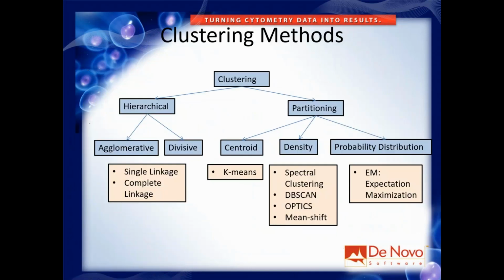So there's a lot of clustering methods. This is just a small subset of the common ones. And here I want to pause and talk about some terminology that is commonly thrown about and dispel some myths. When people come and talk about these, they're going to talk about unsupervised methods, and say, oh, my method is really great because it's unsupervised and it just works by itself.